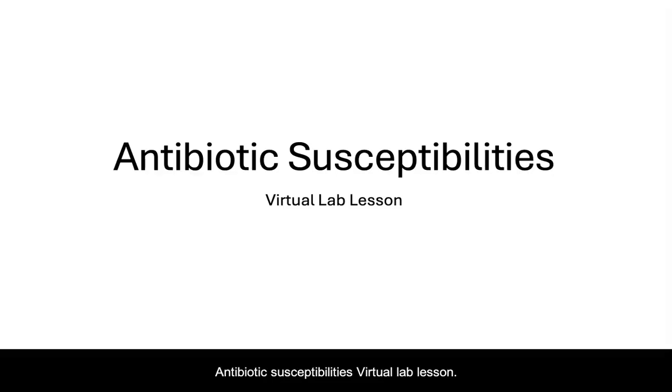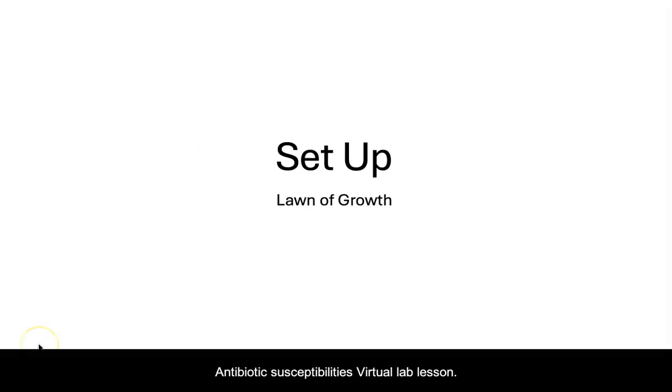Antibiotic susceptibilities virtual lab lesson. Setup. Lawn of growth.